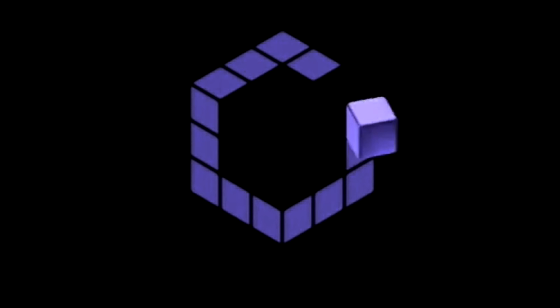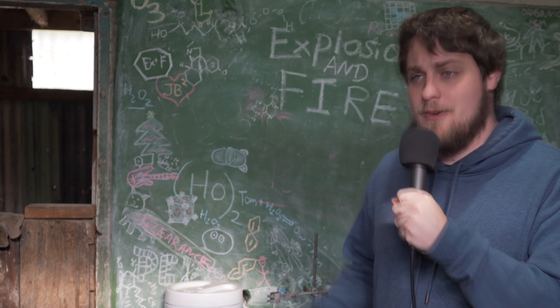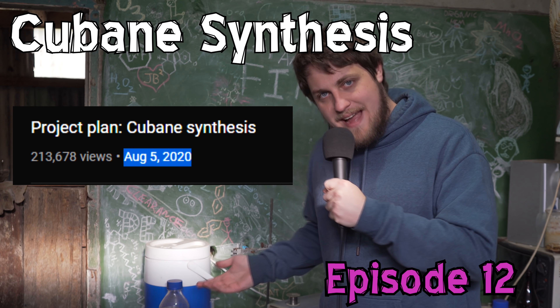G'day, g'day, g'day. How we doing? Welcome back to another episode of the Cubane series. So we're obviously trying to make Cubane from household materials. We've been doing it for a little while now.